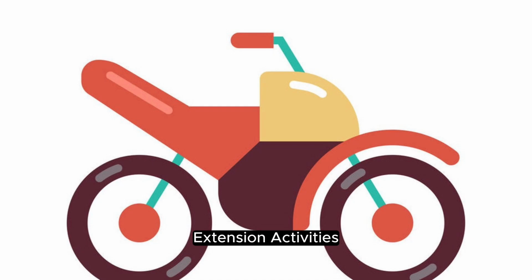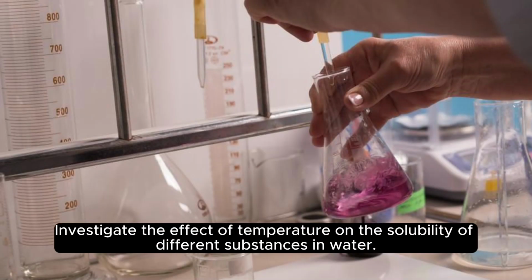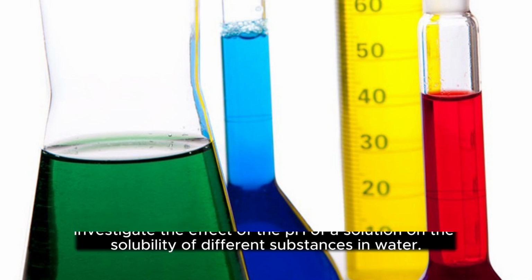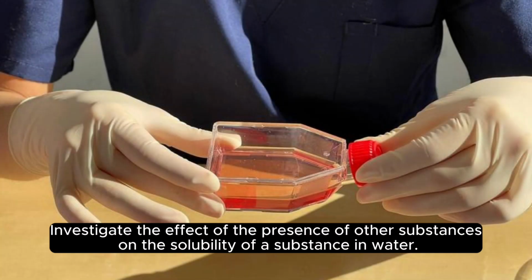Extension activities. Investigate the effect of temperature on the solubility of different substances in water. Investigate the effect of the pH of a solution on the solubility of different substances in water. Investigate the effect of the presence of other substances on the solubility of a substance in water.